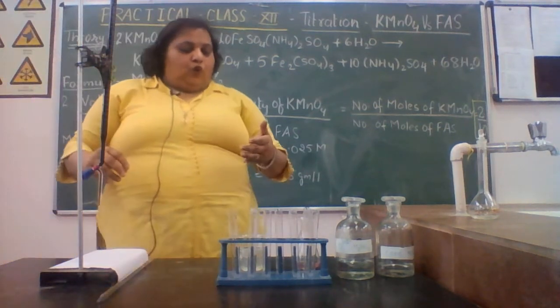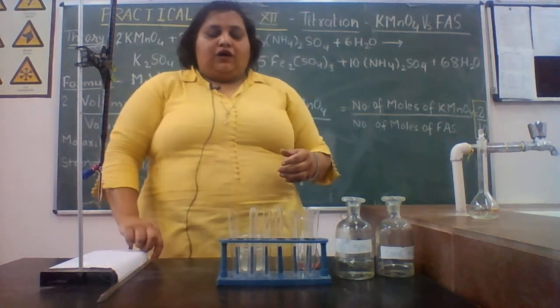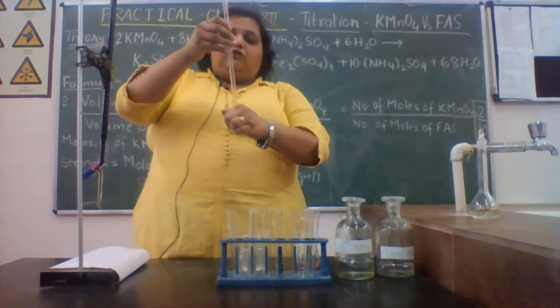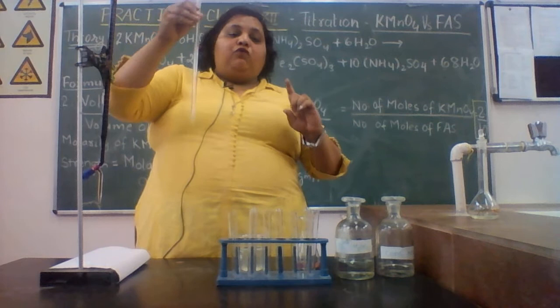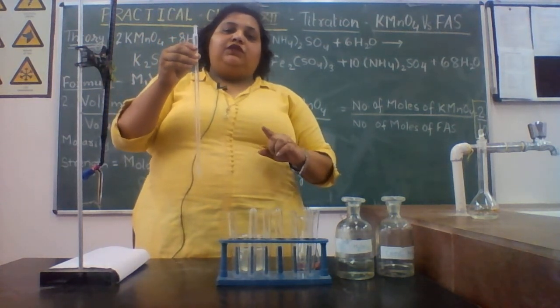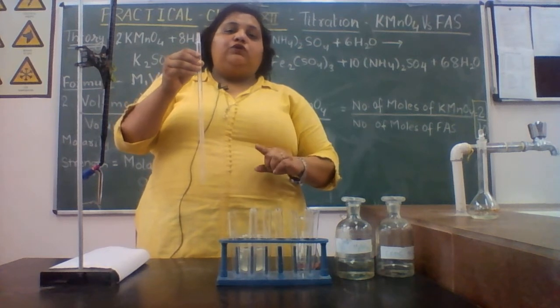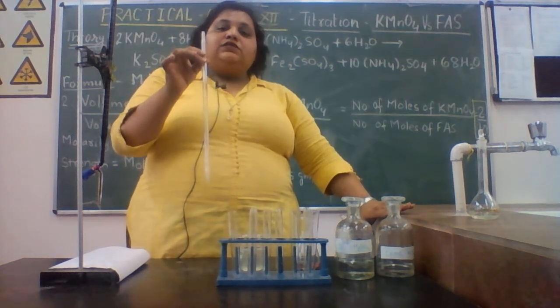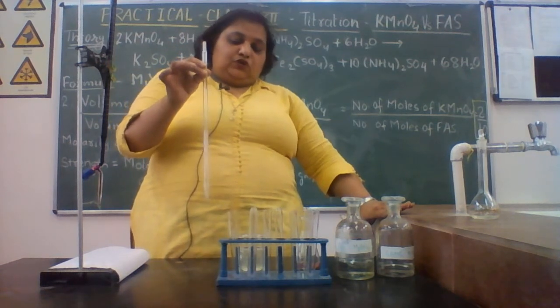Now, what you have to do? Now, you have to take 10 ml, for which I have used the pipette. Before using any of the devices, you must rinse it with the solution that you are going to use. Do not wash it with water, just rinse it with the solution that you are going to use.